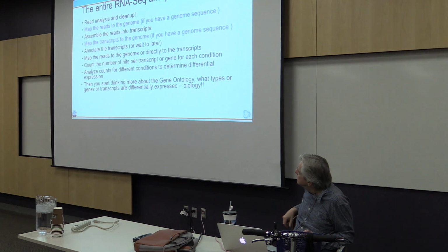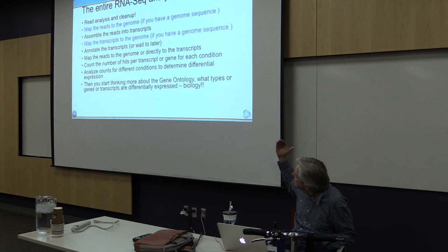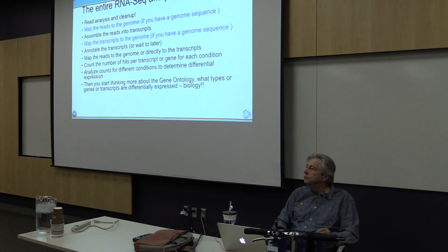One of the things that you do, as I said, once you have your transcripts, they can be linked up with the annotation from the genome, or that is tied to the genome also. But as I also said in the beginning, in some cases you don't have the genome sequence to work with, and some of you may be in that position.